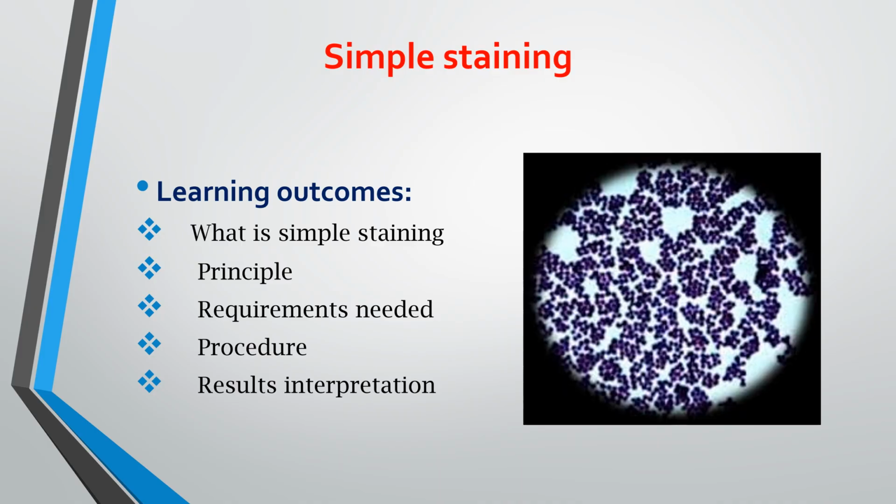And now we are going to discuss the simple staining procedure, a very important procedure in microbiology practicals. So let's see what that is. If we listen to this simple staining procedure, we will know how to perform the staining, what the principle behind it is, what requirements we need, what the procedure is, and how we can interpret the results after the procedure is done.